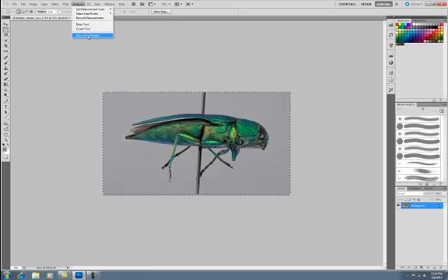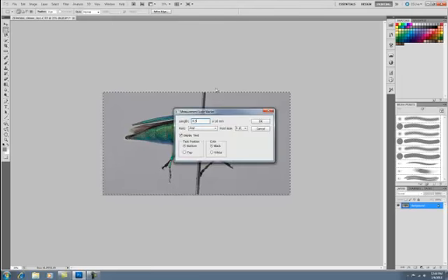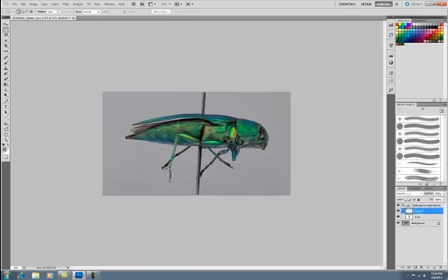So now go back to Analysis and Place Scale Marker, and the length will be multiplied by 10 millimeters. So I'm going to start with 0.5, so 5 millimeters, and then increase the font size, otherwise you won't be able to read it, and then click OK. So that's about a good length for the scale marker. Generally it's good to keep it between about 1/3 and 1/2 of the specimen's body length.